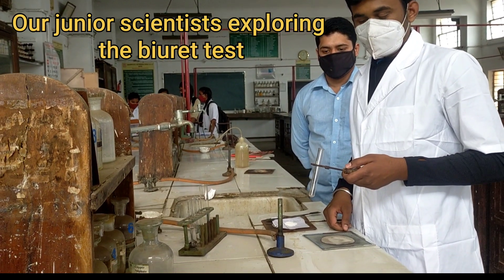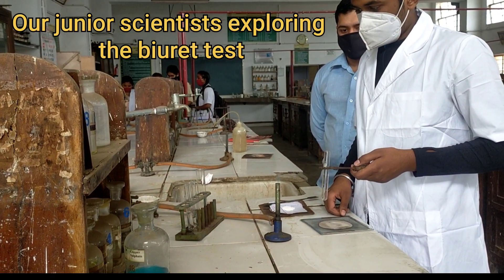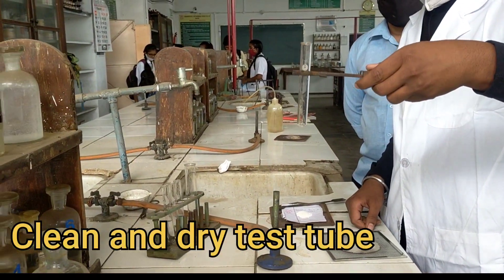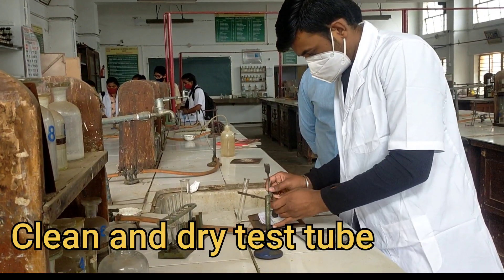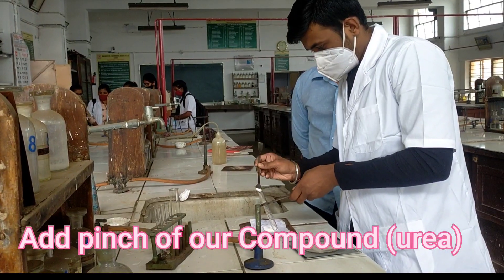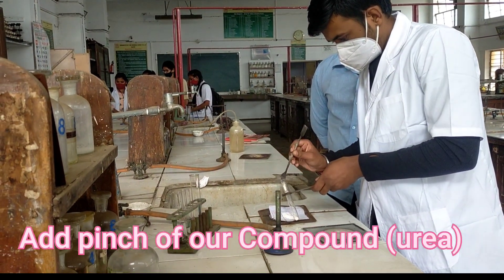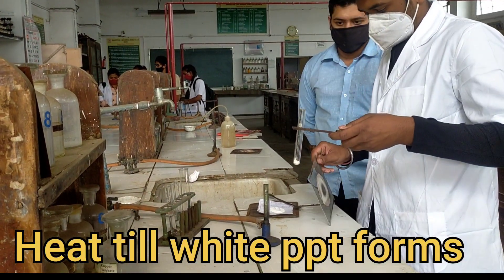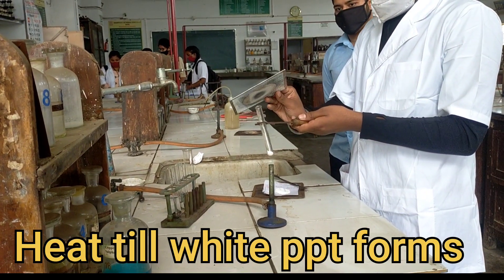Now we are moving towards the confirmatory test of urea. For this, take a clean and dry test tube. In it, add a pinch of our compound — with the help of a spatula, take a pinch of the compound in this clean and dry test tube. Then we have to heat it till a white PPT is formed.